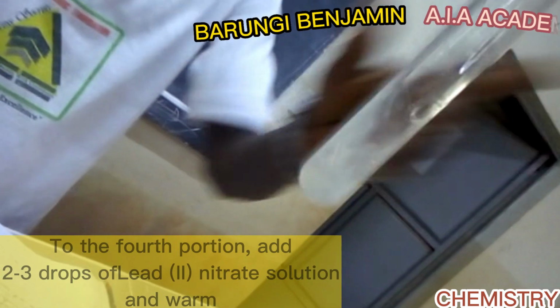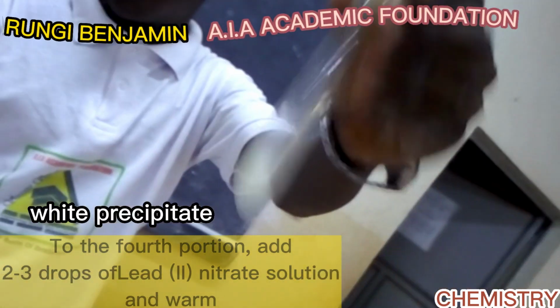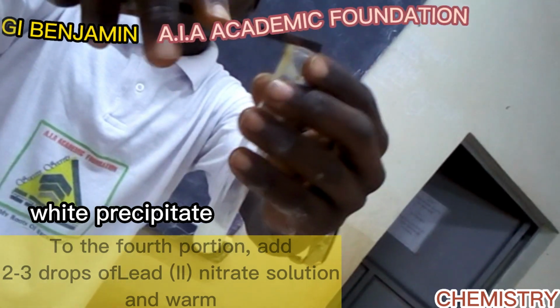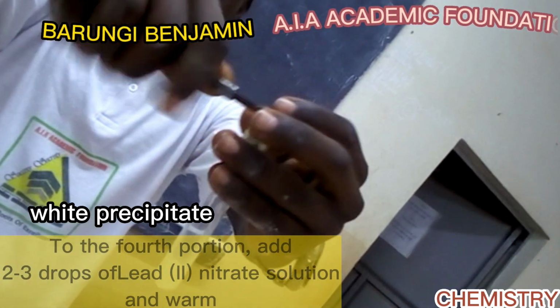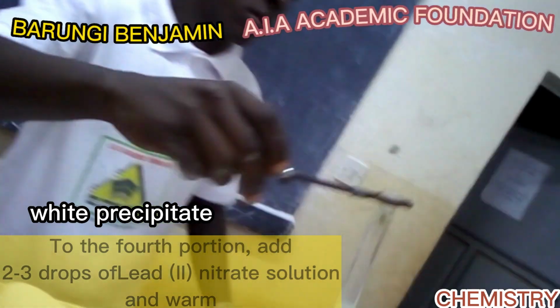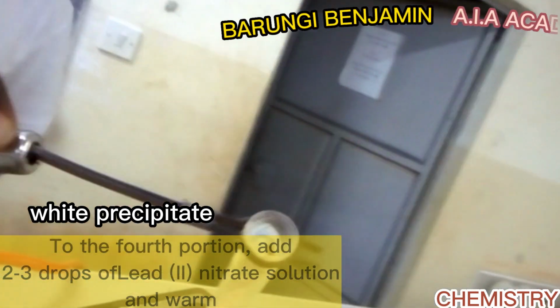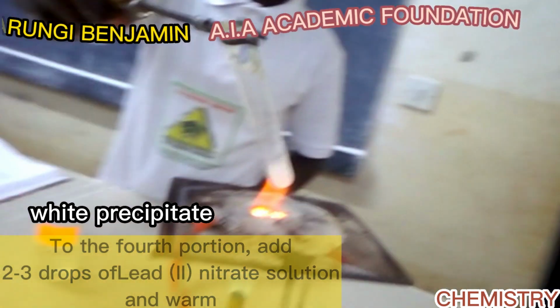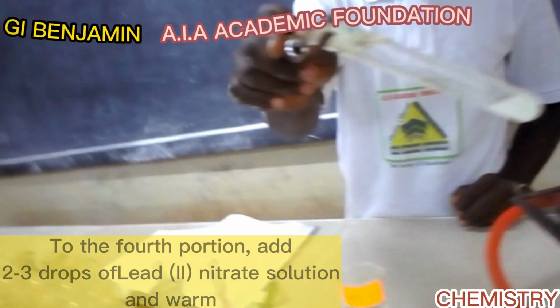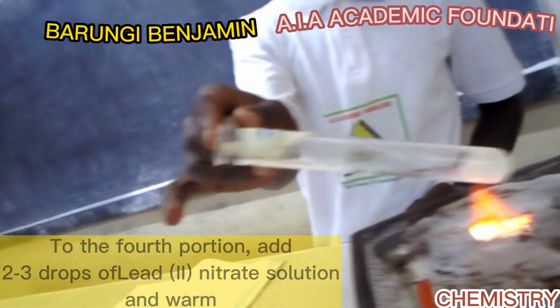So we are seeing a white precipitate has been formed on addition of 2 to 3 drops of lead 2 nitrate. They have told us to warm, not to boil but to warm. So when you're heating or warming, make sure the test tube is a little bit bent.